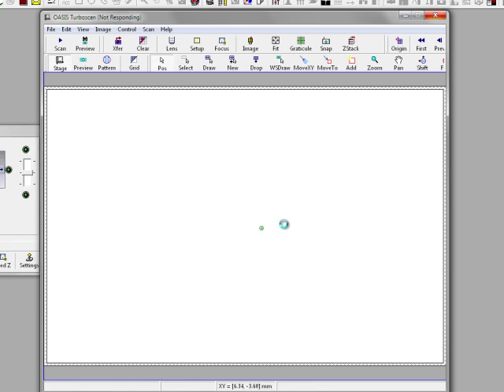Okay. So while I'm doing this initialization, let's talk about why it's useful to have this program. Really, what we can do with the Turboscan module from Objective Imaging is acquire images that are a lot larger in memory size than we can handle in RAM. This is an excellent opportunity. We can take very large, high magnification scans, and we can actually take those and we can view them separately later on any machine that we want to operate with, without creating massive gigabyte files.